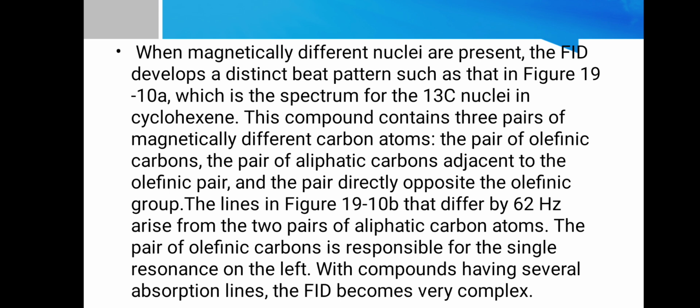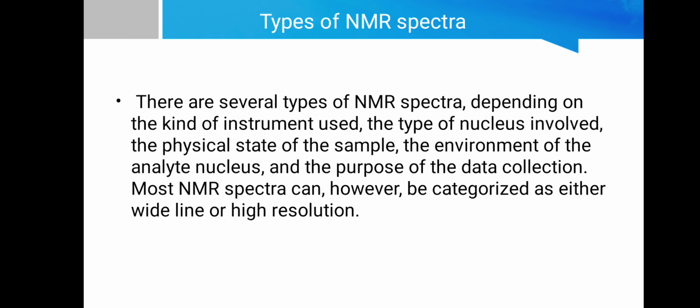With compounds having several absorption lines, the FID becomes very complex. So we are now going to discuss the types of NMR spectra.